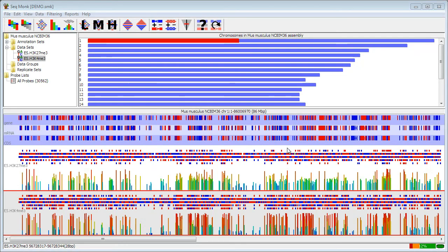After you've quantitated your data in SeekMonk, rather than looking through the entire data set manually, you can now apply filters to pull out regions of interest.